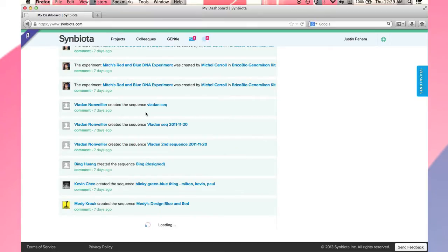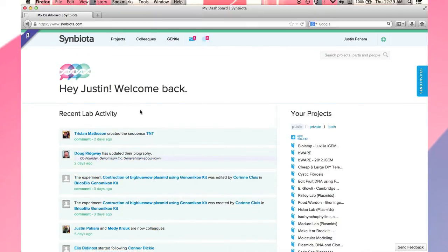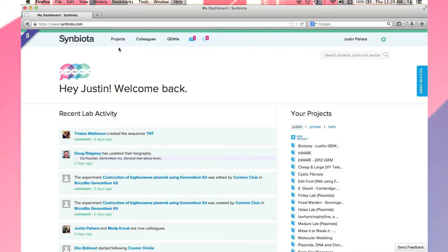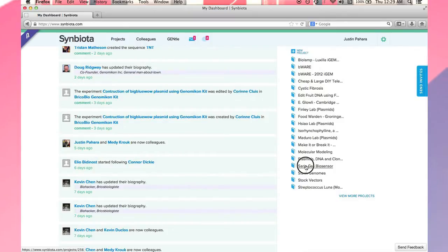All data lives within projects. You can navigate to your projects by using either the link in the navigation bar or by this column on the right. I will now navigate to the open project called Sarin Gas Biosensor.